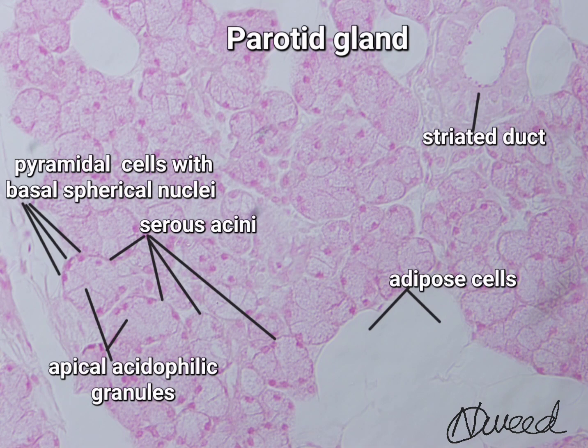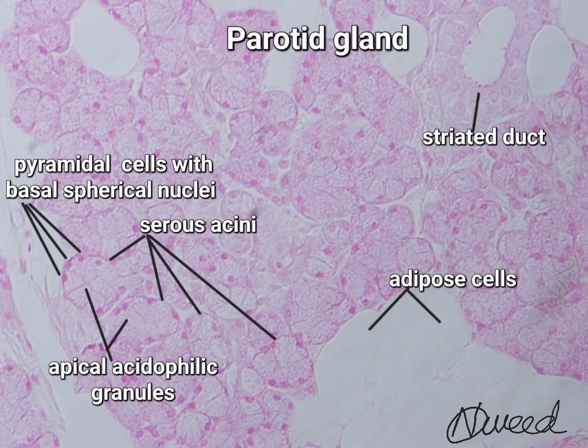Acini open into intercalated ducts that have a small diameter and are lined by simple cuboidal epithelium. Several intercalated ducts open into the striated duct, which has a much larger caliber and is lined by a single layer of low columnar epithelial cells. The interlobular ducts are lined by simple cuboidal epithelium and interlobar ducts are lined by pseudostratified cuboidal epithelium.